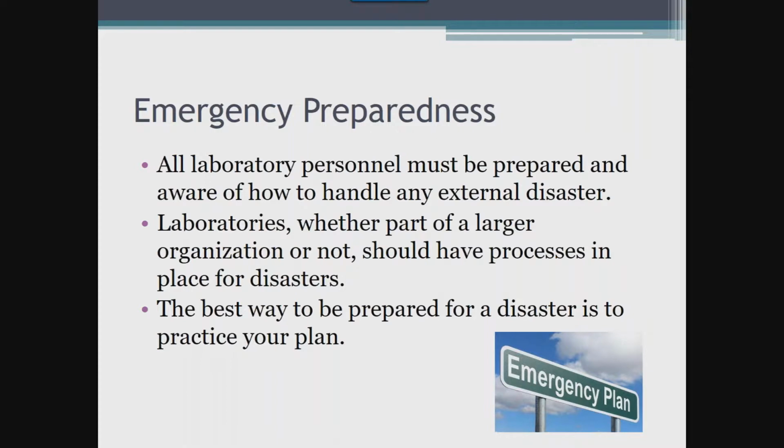Again, like with just about everything else we have reviewed so far today, policies help educate us and serve as a resource for events that don't usually happen often, but are events that we need to react to sometimes quickly. These policies might include what the lab's role is in the situation of a bigger event that the larger facility might be involved in, such as vehicular accidents or events that might be happening in the emergency room.